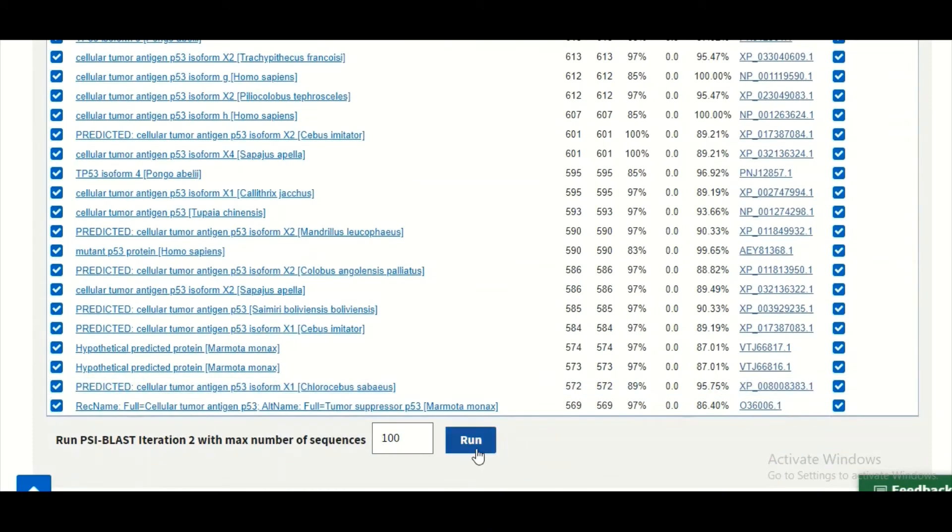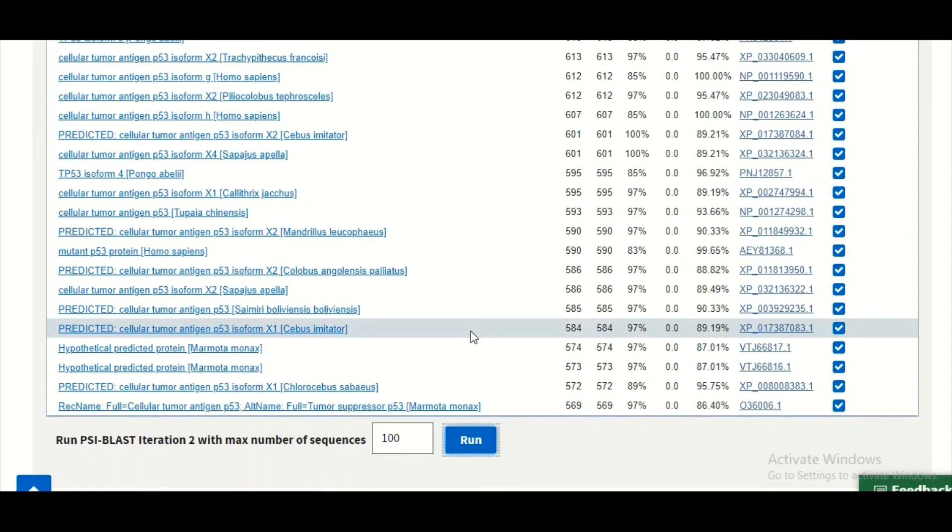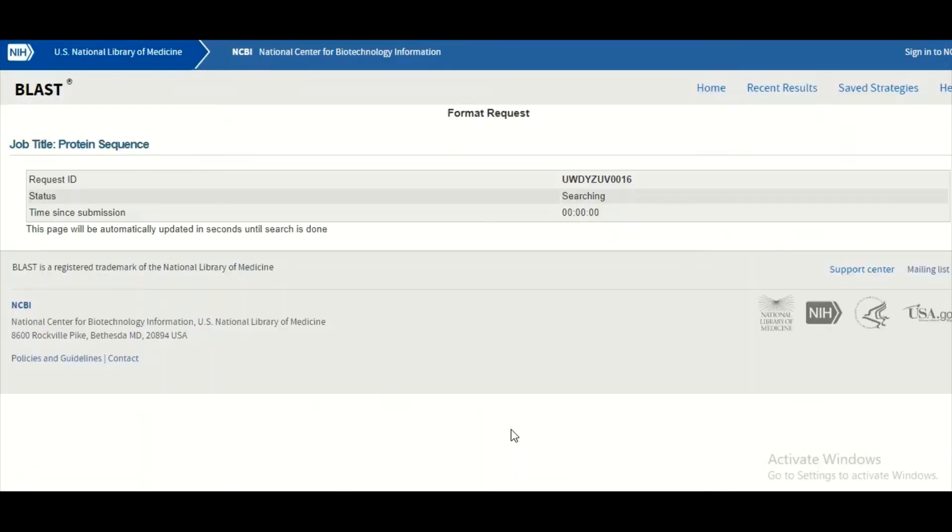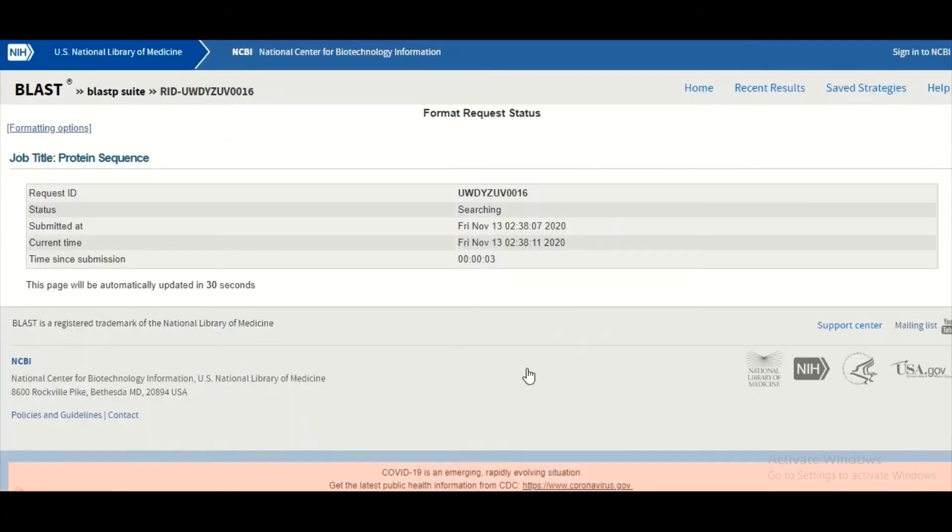Then we will click on this run button so that all of these sequences will be multiply aligned, and then from this multiple sequence alignment the PSSM will be built.